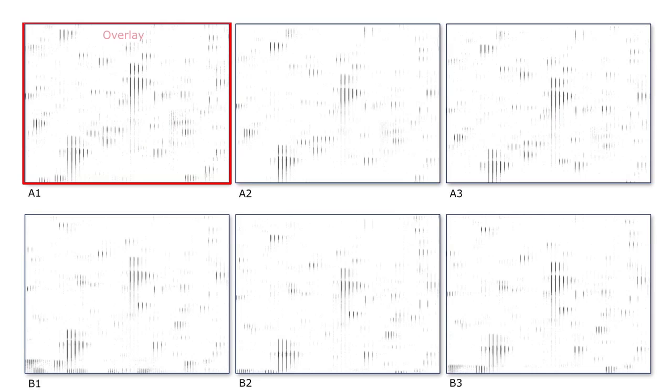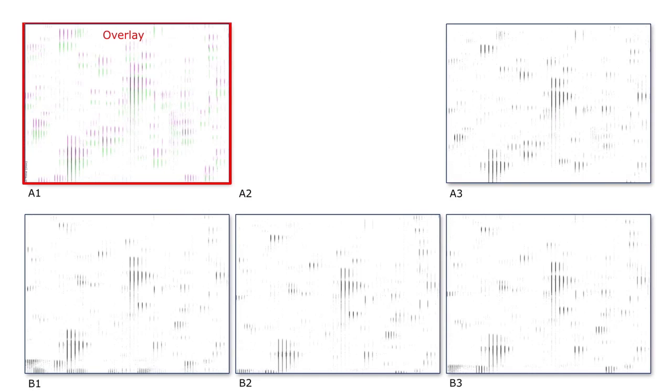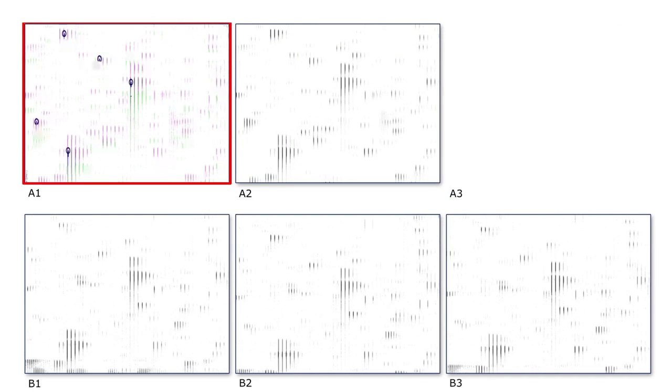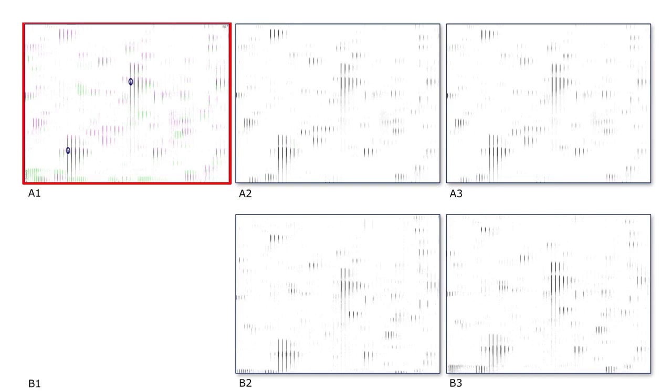The first step of alignment is to overlay the samples. You can now see the data from the 2 samples in 2 different colors, and that they are currently misaligned in the vertical LC dimension due to small retention time differences between the samples. To compensate for this difference, Progenesis creates a series of alignment vectors, which are then used to align the data. So, where we clearly had 2 sets of data, we now appear to have just 1. We can then separate the samples and repeat for the other 4 samples.